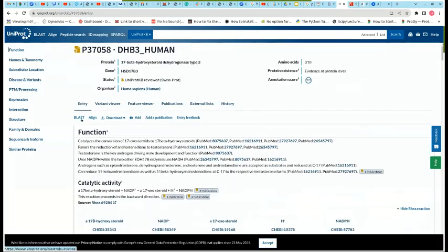So you can also do blasts here. If you blast it just as you've done in the previous lecture with Dr. Fatoki, it's going to give you a protein that's crystallized already in the PDB that is very similar to what you have.